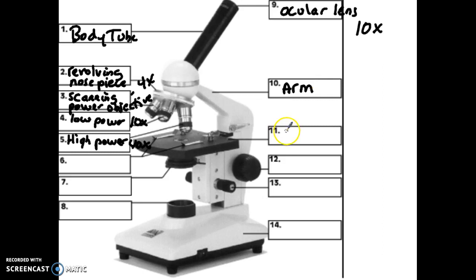Number 11, this is the stage. A stage is used, and I use the terms very specifically. This is more of a support mechanism. It supports the slide. It does not hold it. If the slide was on the stage and you tipped the microscope over, it would slide right off. That's not really a holding mechanism, but it supports it.